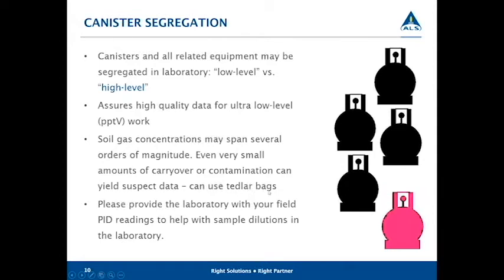I think we would prefer that you use the bottle vacs if you suspect that you have high concentrations of VOCs. It helps the laboratory if you can provide the lab with your PID readings, or just give a heads up on the chain of custody or paperwork that you're issuing with the samples to the lab that, hey, these may be suspected high in concentration.